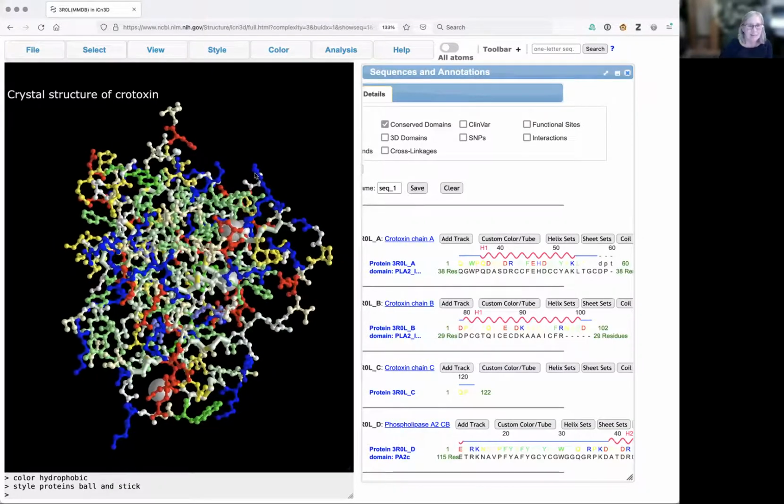I can't tell what colors correspond to charged amino acids, what colors correspond to hydrophobic amino acids, what colors indicate amino acids that are polar but not charged, and what colors indicate amino acids that are somewhere in between. I can figure all this out by using the select by properties function that we talked about earlier.